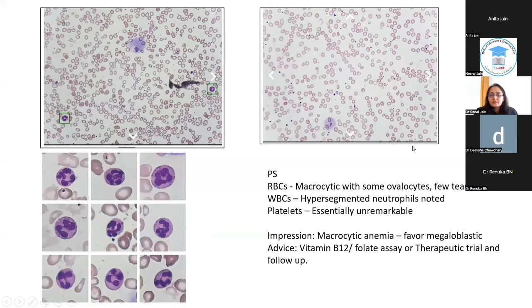You see, just to highlight, this is the kind of cell that's a polychromatophil. This is a grayer shade than the rest of the RBCs. That's how polychromatophils look.